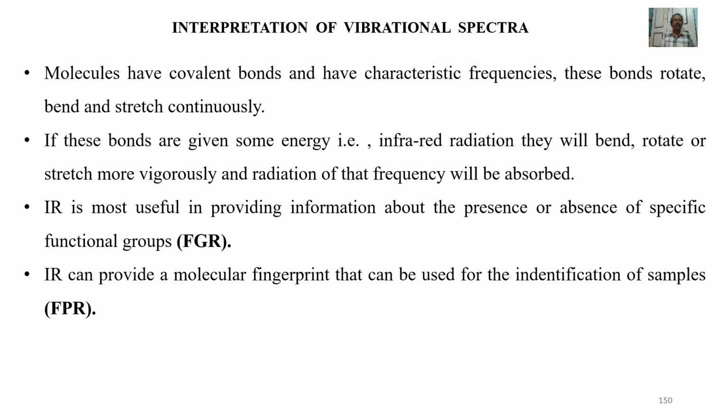Let us learn interpretation of vibrational spectra, that is, how we can interpret the IR spectrum.